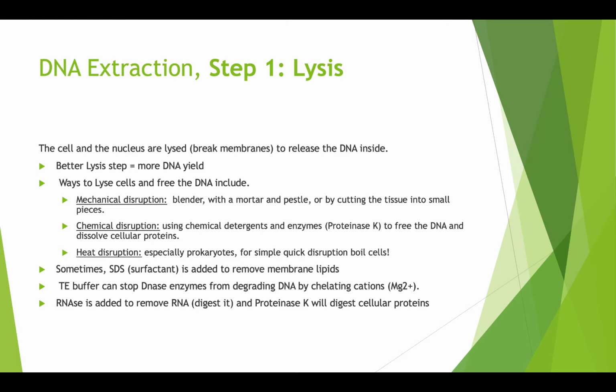The other side of the spectrum: the harsher the method you're using, the more likely you might shear the DNA, which means there is a certain limit. But usually these methods are created to limit the shearing of the DNA and to break everything else. So what do I want to do? I want to break the cell and digest everything else in the cell except the DNA.